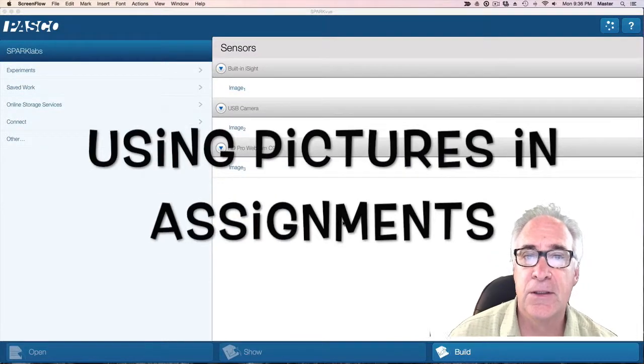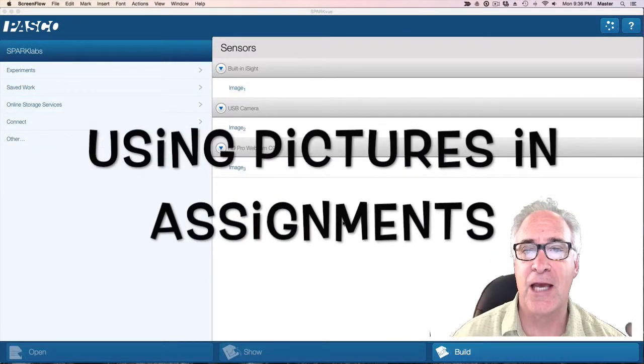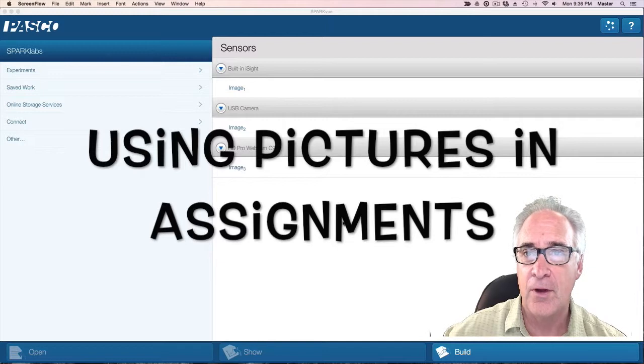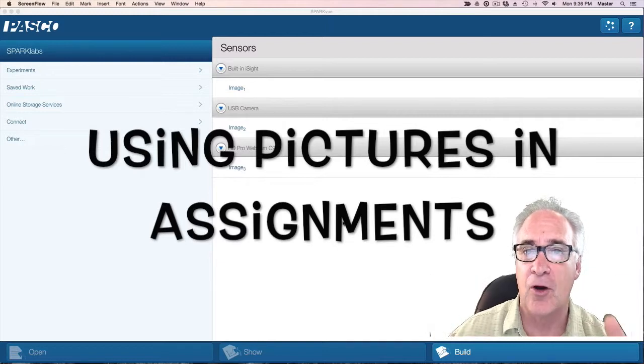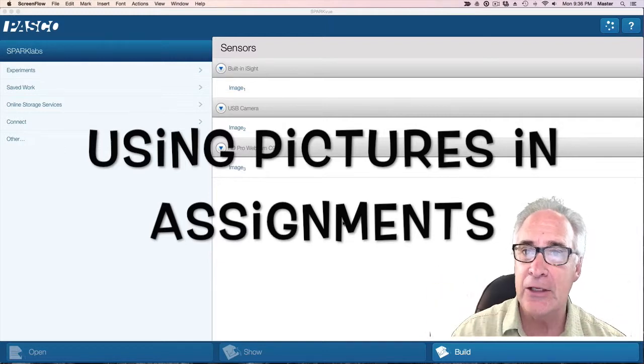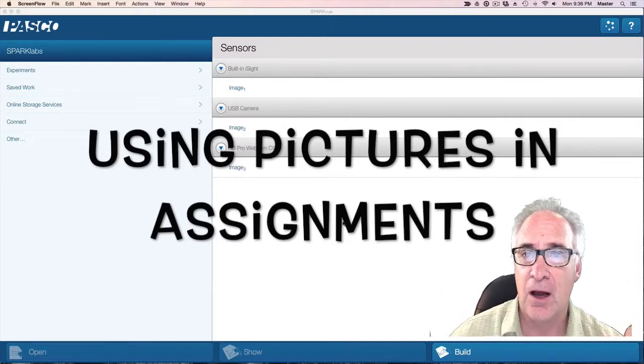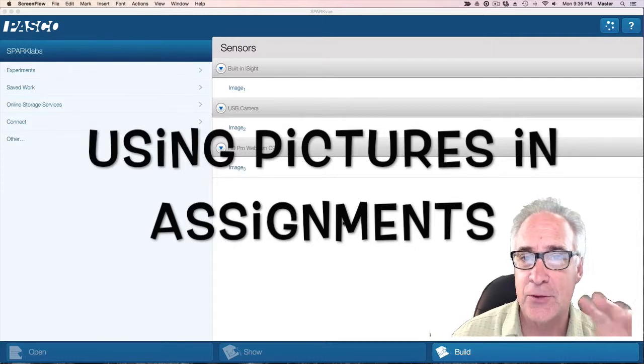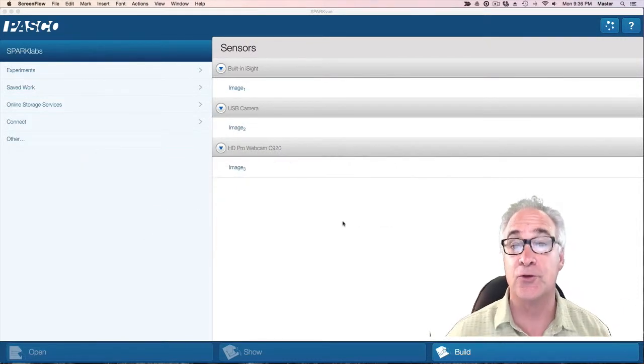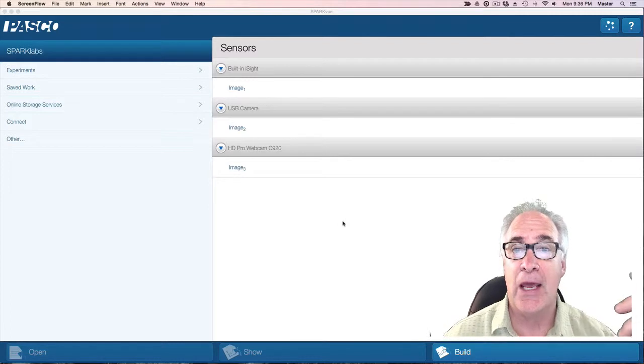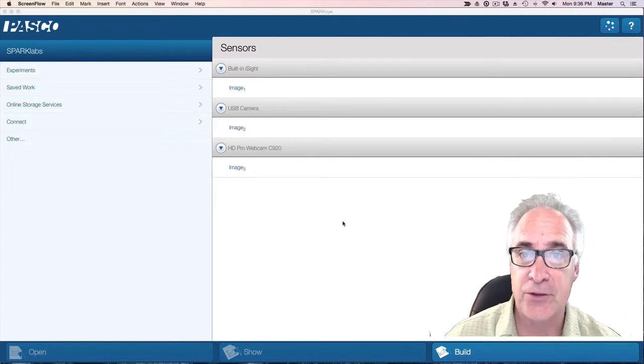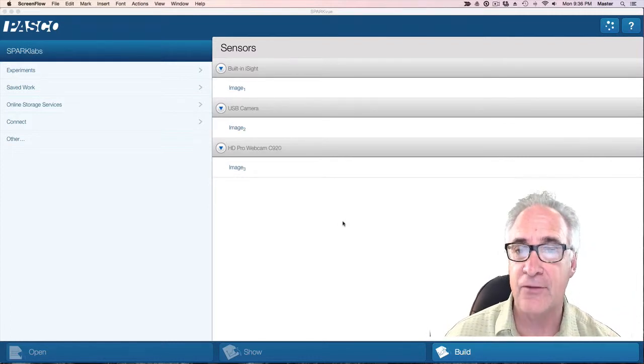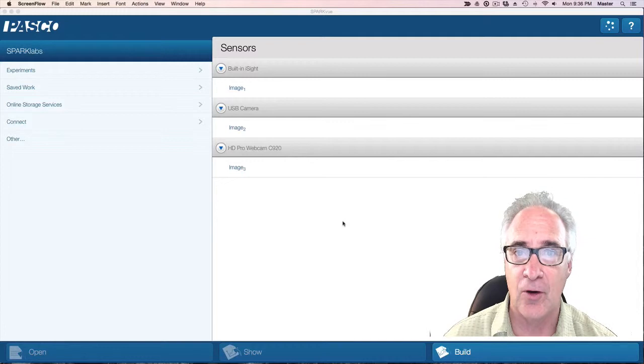Welcome. Today we're going to talk about how to get your images off the microscope, labeled, and into Google Classroom. There's a couple different ways you can do it, but I'm just going to show you one of those ways using Google Drawings and a digital microscope.